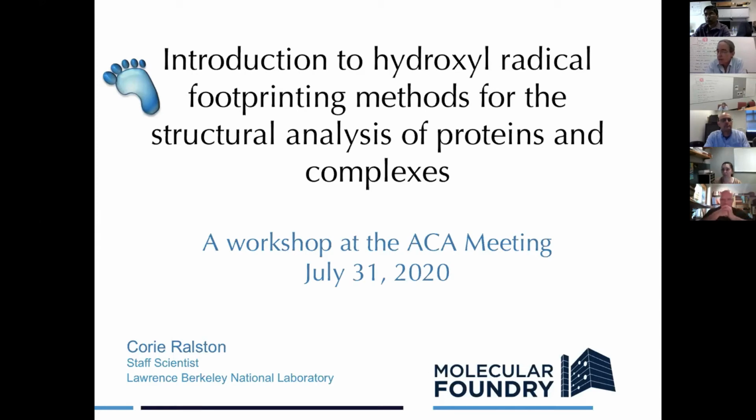Okay, so today you're going to learn all about footprinting, the latest advances in the method, various ways to do footprinting, and we're ending the day with a practical session so you can learn how to start doing the footprinting data analysis.